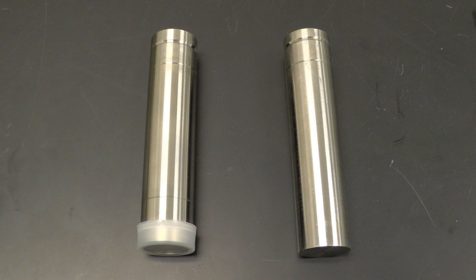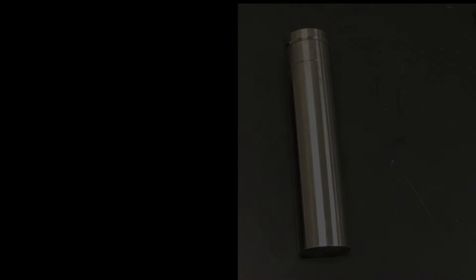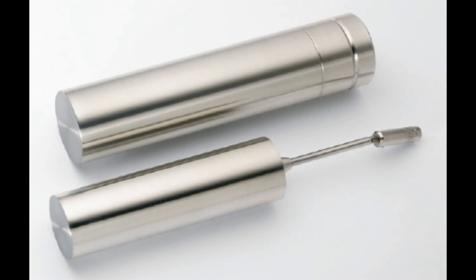The second option is to get the UL adapter in 316 stainless steel which is used for corrosive or acidic applications. The 316 stainless steel version is only offered in the closed tube system. It has a solid sample chamber, eliminating the need for an end cap.